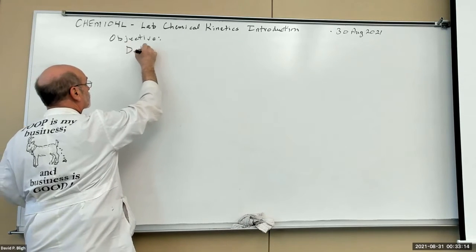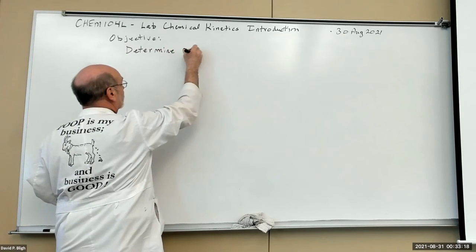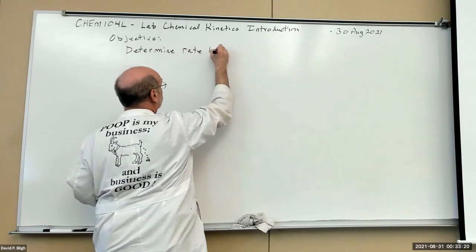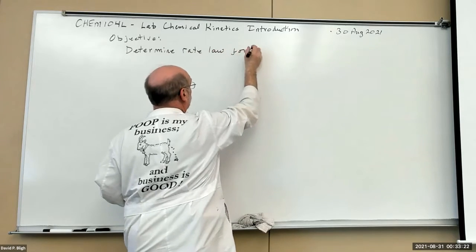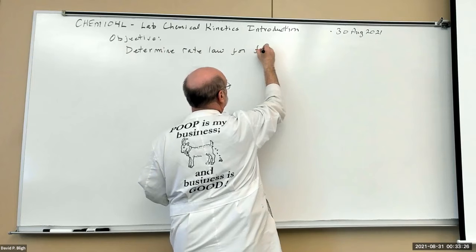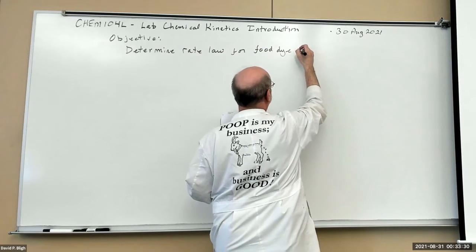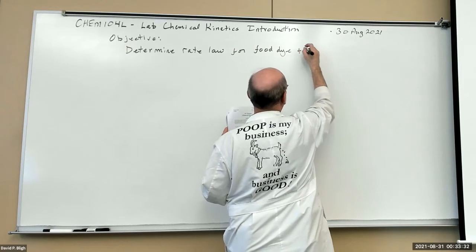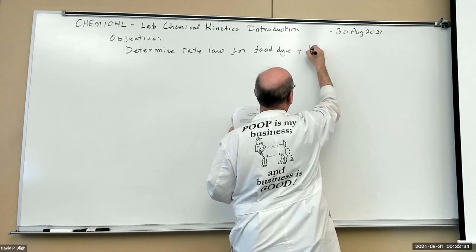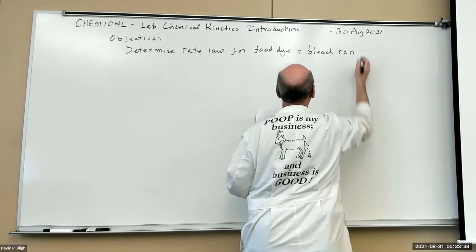determine the rate law for a food dye plus bleach reaction.